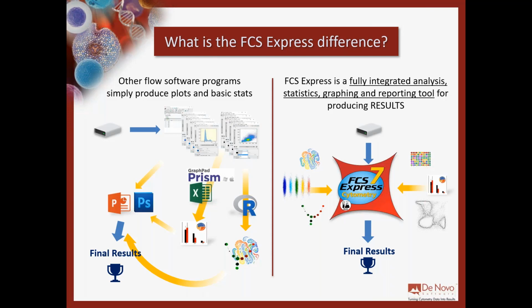Even if we say that this is the analysis, actually the analysis is a much bigger process. Because once you have plots and numbers, then you have to put together your final results by copy and pasting or exporting to PowerPoint or to Photoshop.